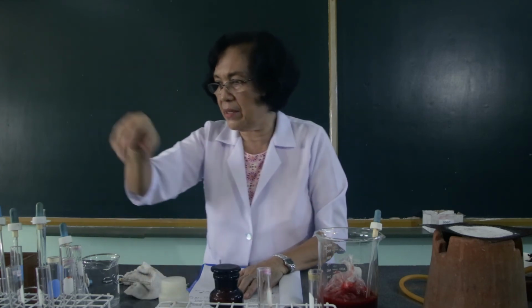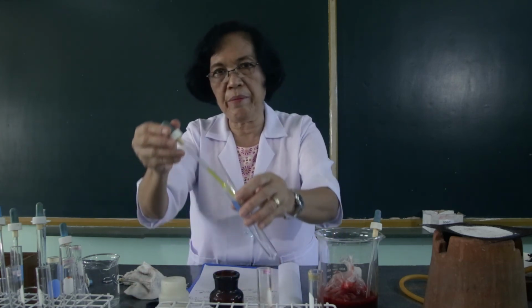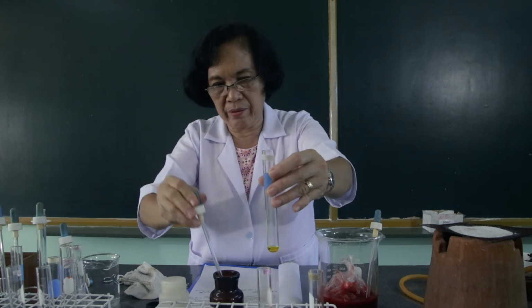Then I'm going to prepare here the reagent wherein there is the Stokes reagent and the ammonium hydroxide. So this is the Stokes reagent. This is the ammonium hydroxide. I'm going to use 2 ml of the Stokes reagent.